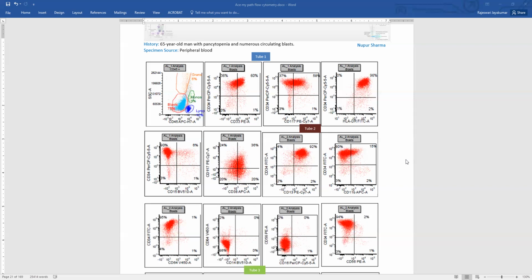We also have antibodies for markers like CD123, for example. Some of these are used for prognosis, like CD56. So it is always important to document what the blasts express. If it is a partial expression, it's a good idea to give the percentage of blasts expressing that marker. Most labs usually have a table for that purpose. You'll see that in the final report, they don't write the percentage in the body of the report. It is usually seen in the table.